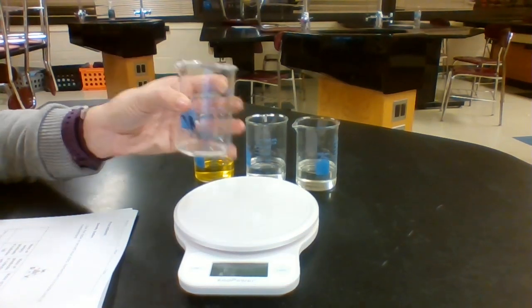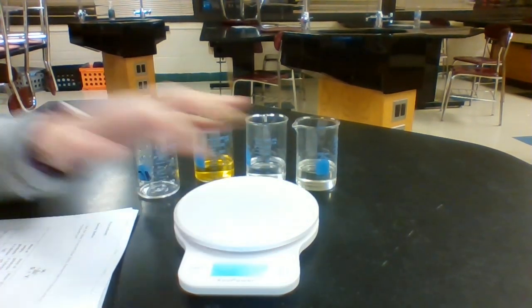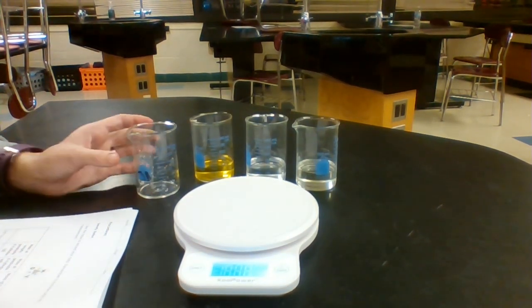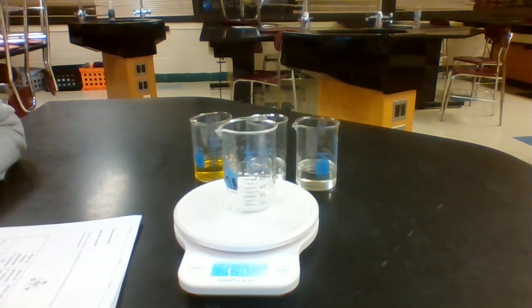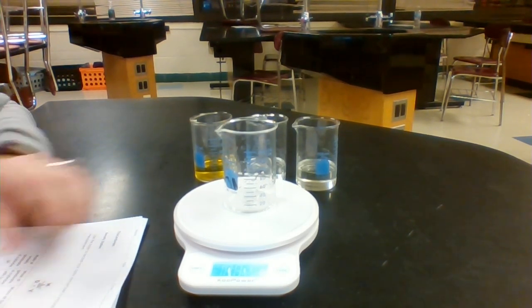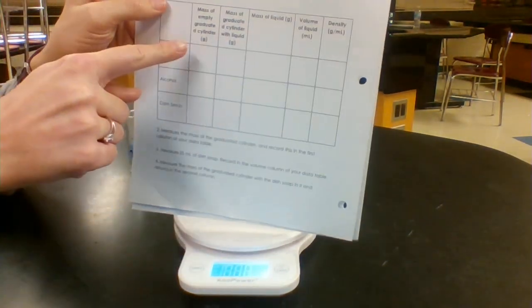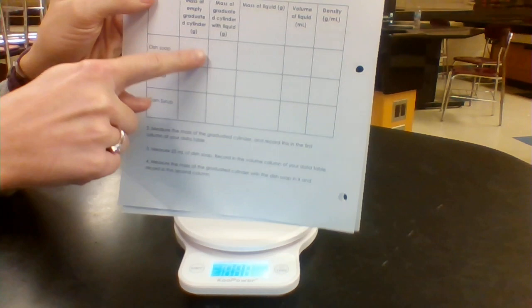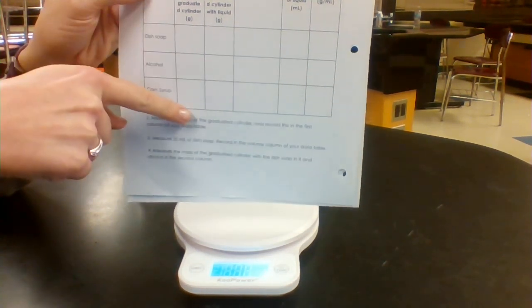So I'm going to find the mass of this container so that I can subtract it later. When I find the mass, I just use the scale. So I put it on. The mass of this container is 68 grams. What I want you to do now, for the mass of the empty container, is write that, 68 grams.